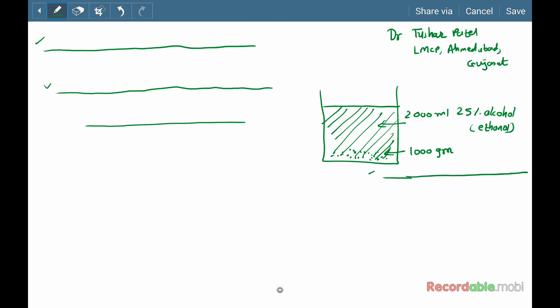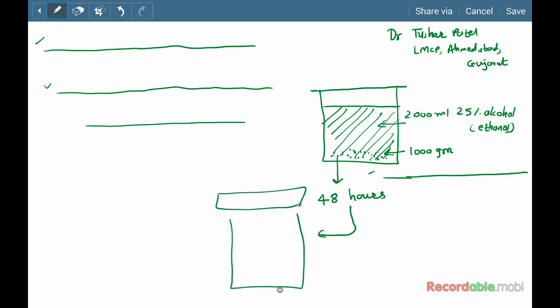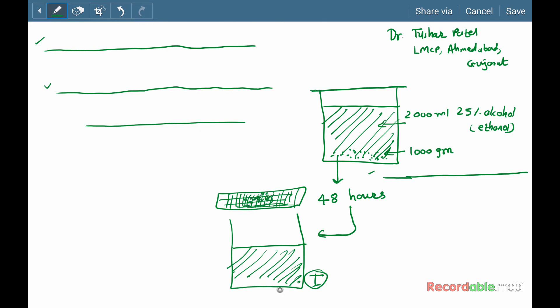Cover the container. Now keep this for 48 hours for maceration. After that, filter the solution. Collect the filtrate. This is filtrate number one. Here are the small pieces of the bitter orange peel.